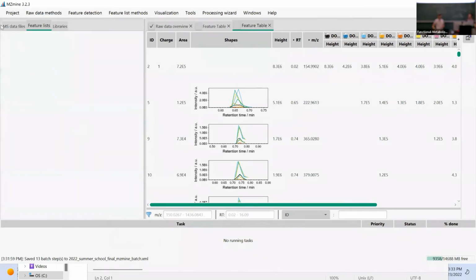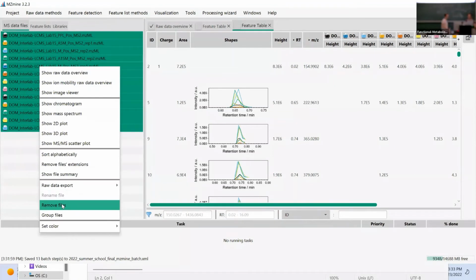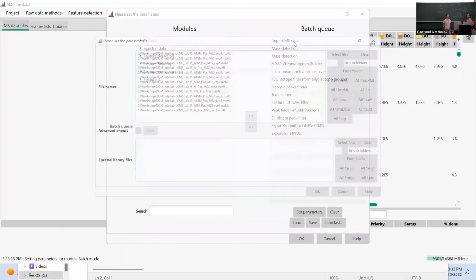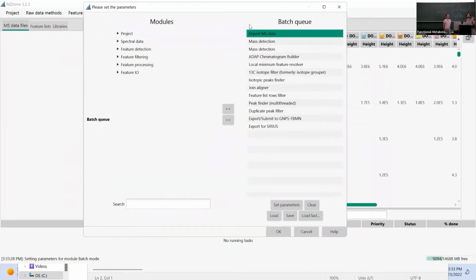Let me do it with you so you can follow along. If you really run from the batch file, this is lab 15, but that's why you can run from different steps. So first, you just open the batch file.